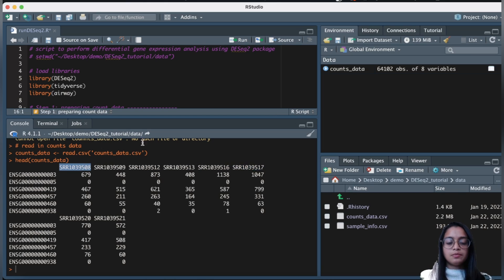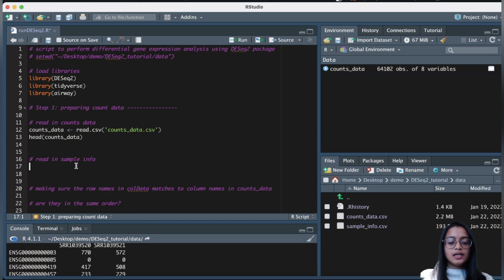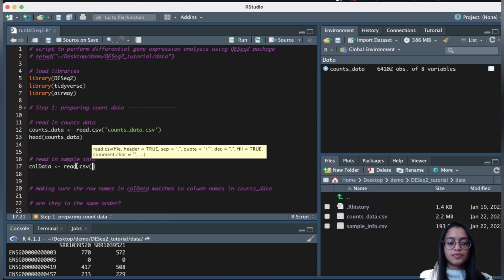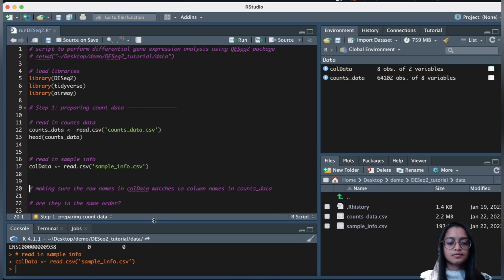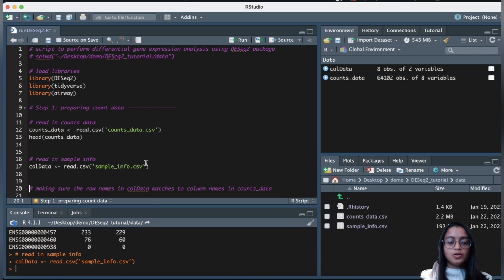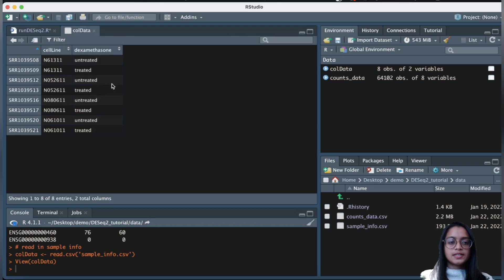We don't know by looking at the column names which samples are treated with dexamethasone and which are untreated, so let's read in the information about the columns. I'll save it as column data and read the CSV file. Now that we've read the column data, we can see information about what sample name corresponds to what cell line and whether it's treated or untreated.